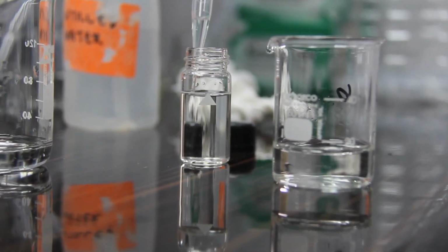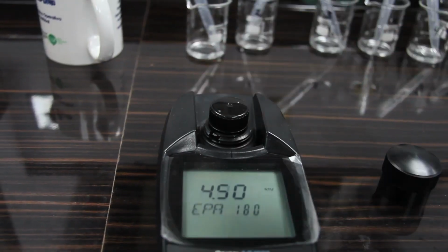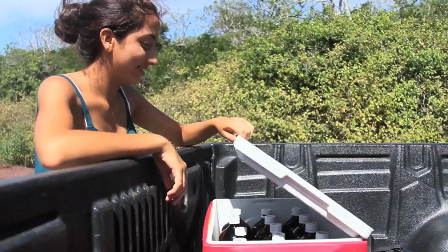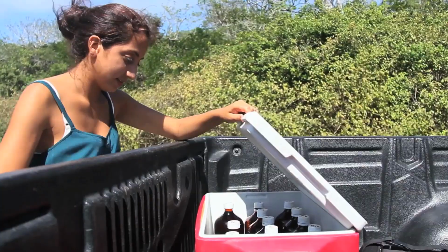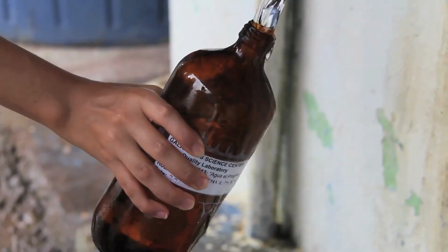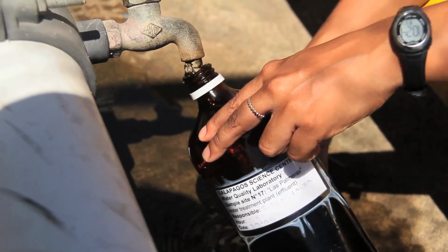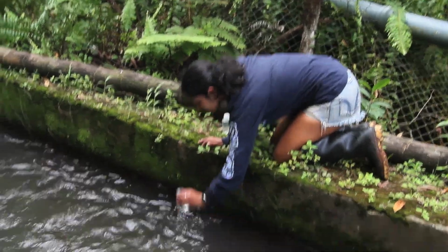Right, so the things that we're measuring are microbes that are in the water that could be associated with fecal contamination. So we're measuring microbes Enterococcus, which is a standard indicator for water quality, as well as E. coli, that's associated with fecal contamination. Basically, we're going around town and collecting different water samples from treatment plants and different springs and the beaches to see if there's any fecal contamination of the water.